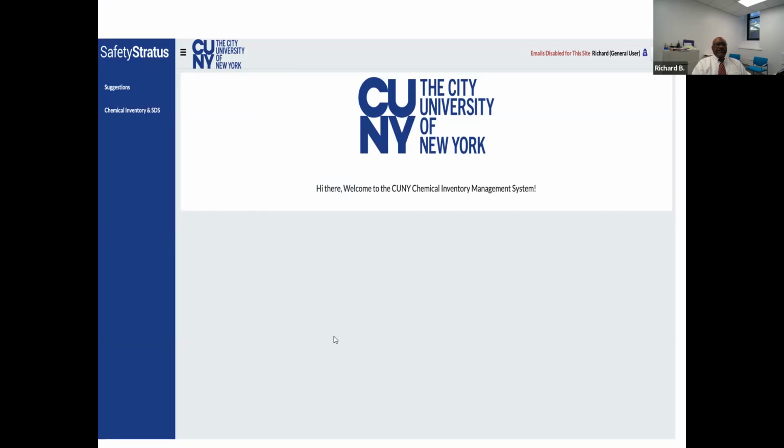Now, the next couple of slides, I'm going to give you a brief review of what the chemical inventory system looks like. On logging on to the system, you'll be greeted with the City University of New York chemical inventory system. City University of New York, as opposed to City College, because like I said, this is a university-wide implementation, a software product that is made available by the City University of New York Office of Environmental Health and Safety, and an instance that we have access to here.